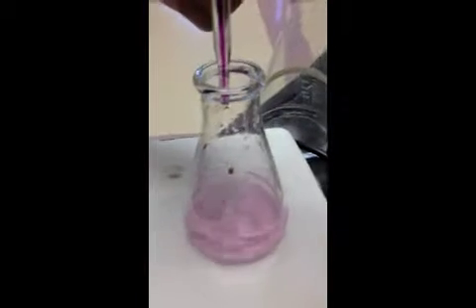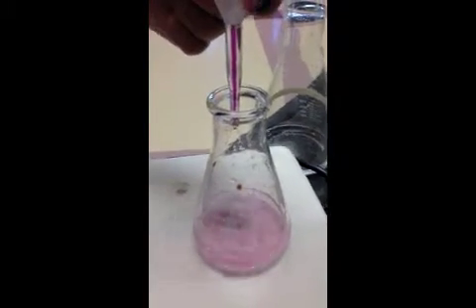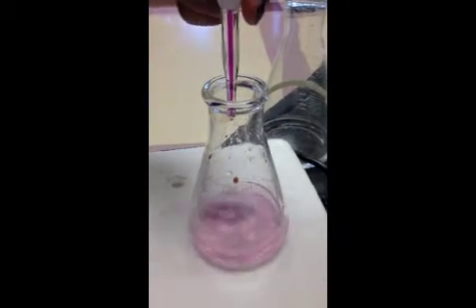Since the pale pink color is staying, we can conclude that the titration has reached its equivalence point.